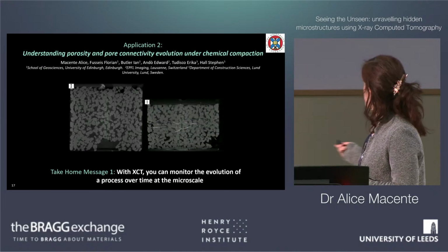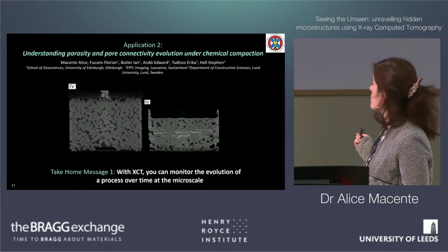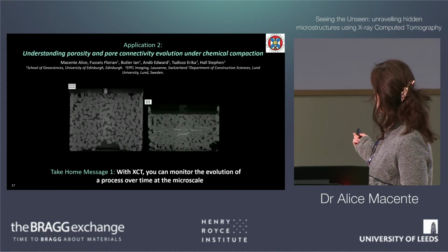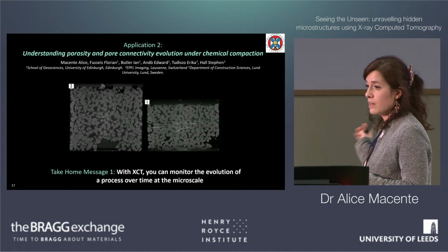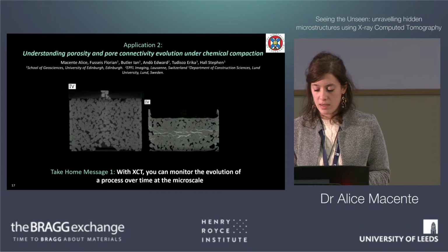But what is also happening is that when we have the presence of these white grains, which are the biotites, the porosity is actually greatly reduced. And if you look very carefully, we have way more salt grains nearby the white particles. So what does that mean in terms of pore connectivity and permeability?